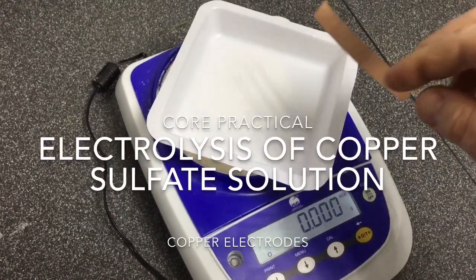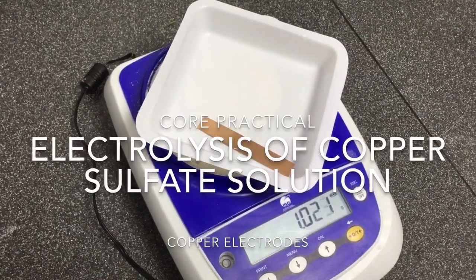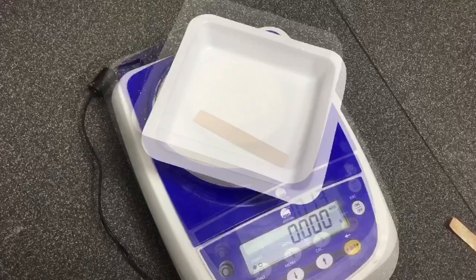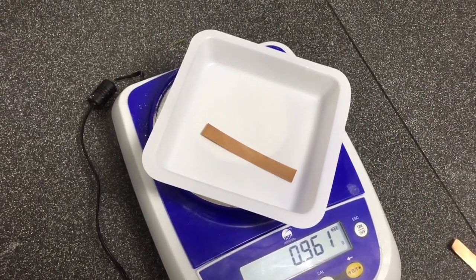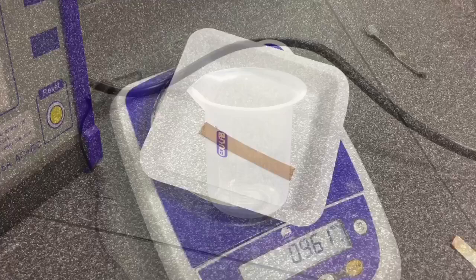In this experiment we will investigate the electrolysis of copper sulfate solution using copper electrodes. Our first step is to measure the mass of each of the two different electrodes that will act as the anode and the cathode.